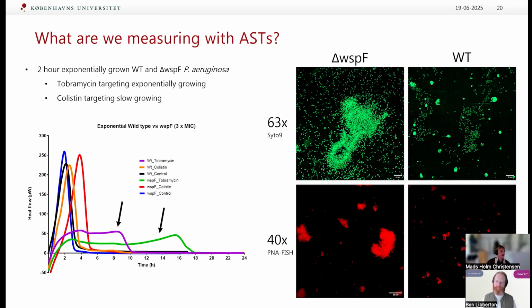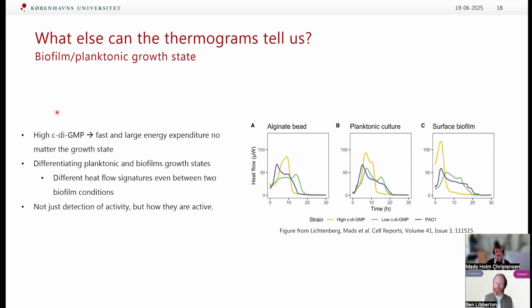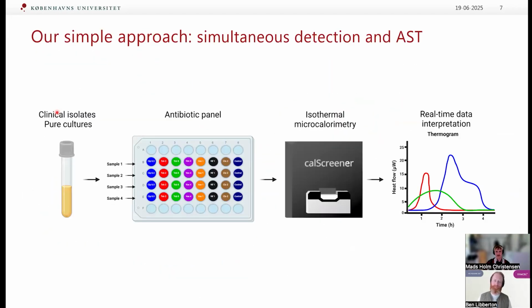So that was done in collaboration with a very kind doctor from the hospital, from the department where we got these isolates, and he guided me through what to use. And the panel that I've designed for this initial part of the study, maybe I can bring it up.